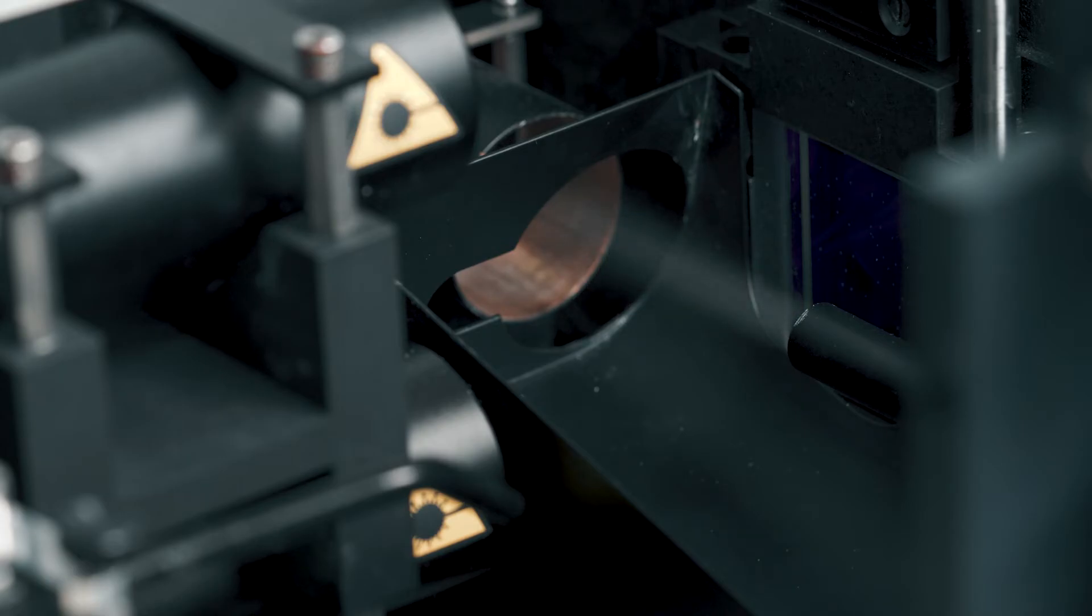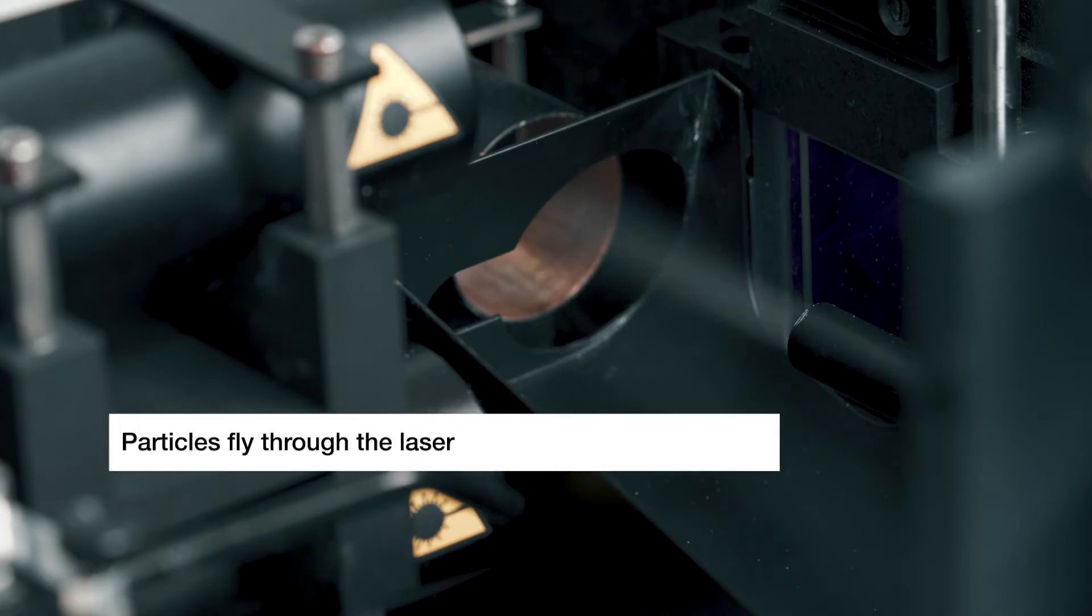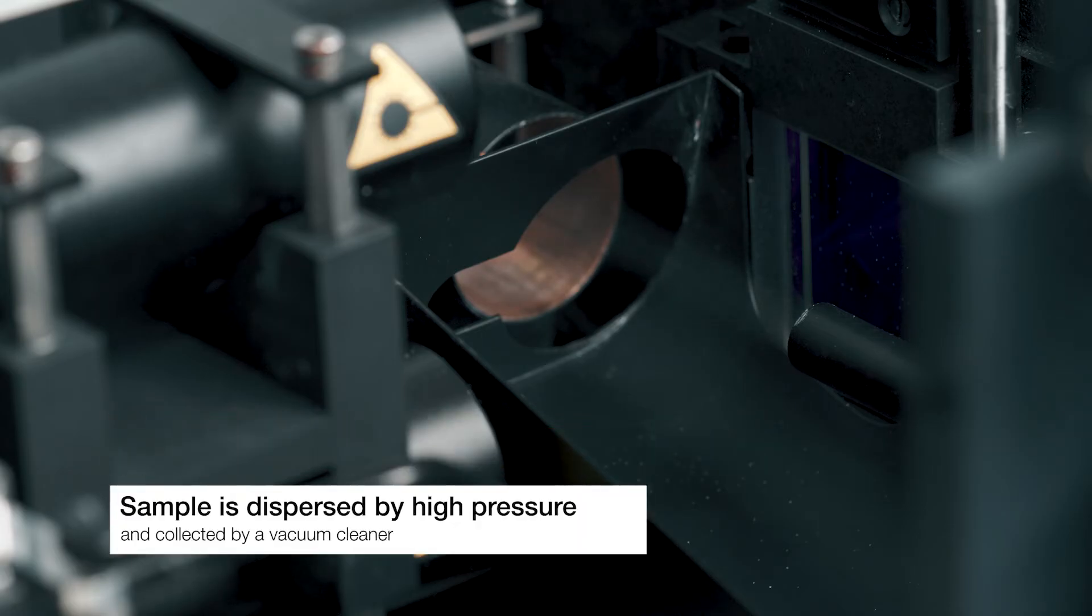In dry measurements, the sample particles fly through the laser beam. The samples are dispersed using compressed air and a venturi nozzle. After measurement, the samples are collected by a vacuum cleaner.